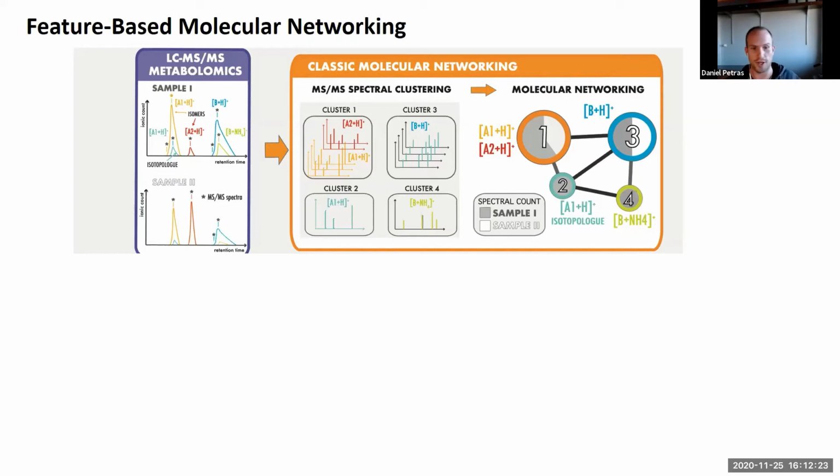Also, if you want to inspect somebody else's data, as we did over the last couple of weeks from a couple of papers that made their data public, there you can also just pull this into your browser visualization tool.